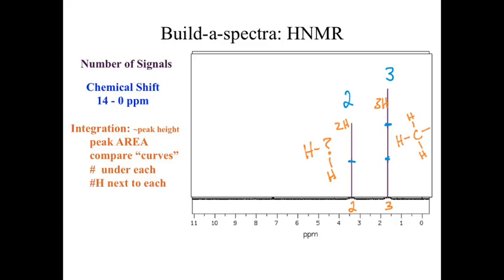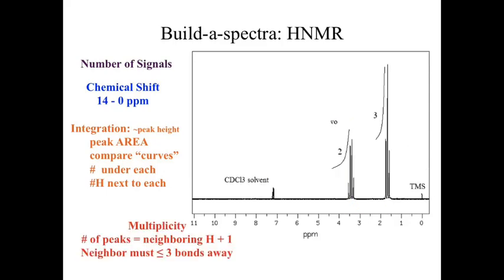So we can now move to the next piece of information, which is our multiplicity. Okay, so now we're back to the whole shebang. We've got the whole spectrum on here. So before we crack into the multiplicity, let's again address some issues here.